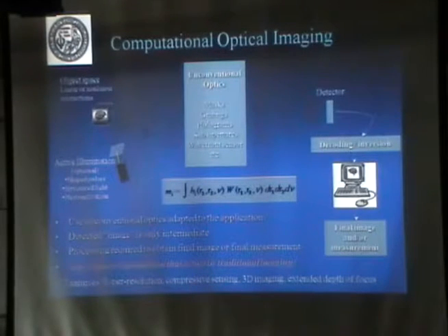Now, this is related to Crisante's talk yesterday. In computational imaging, we have some freedom to make things. And we are not going to use just a lens. Instead of using a lens, we take the freedom to use masks, gratings, holograms, and play around with different unconventional optics. We can also play with illumination. We can illuminate with structure, change the illumination, the angles, the wavelengths, etc. Pulses.